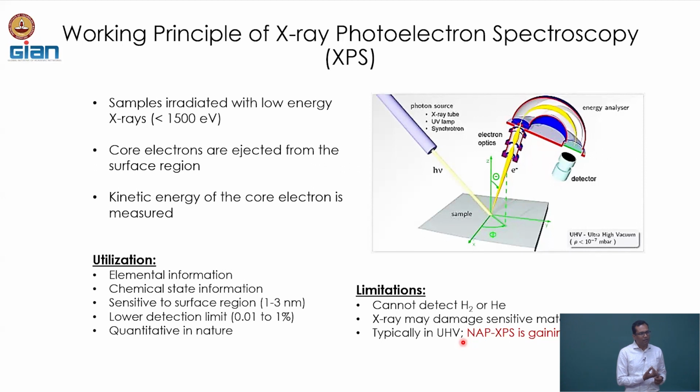Okay. For that, in recent days there is development on the NAP XPS, and we are going to take all the examples from the NAP XPS today. It is near atmospheric pressure X-ray photoelectron spectroscopy.